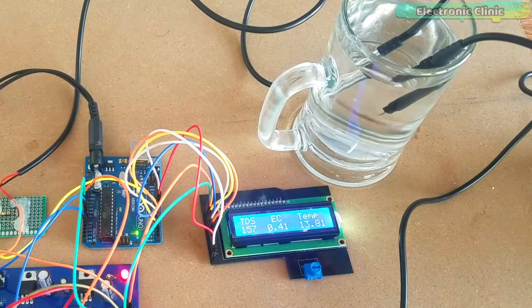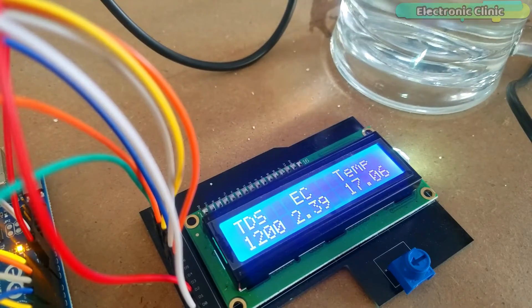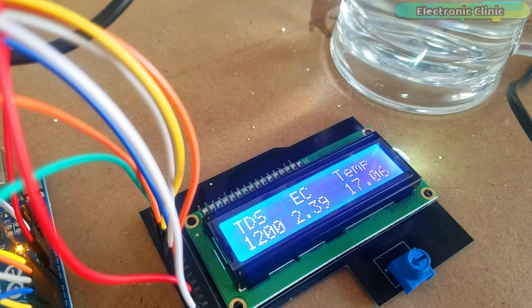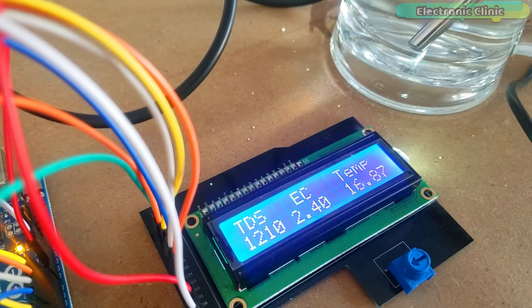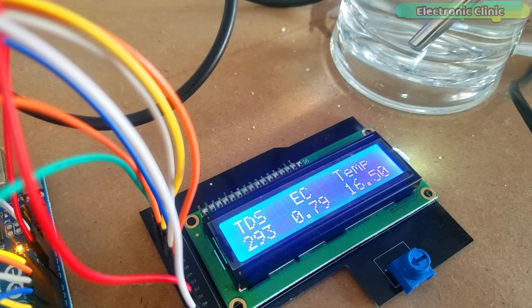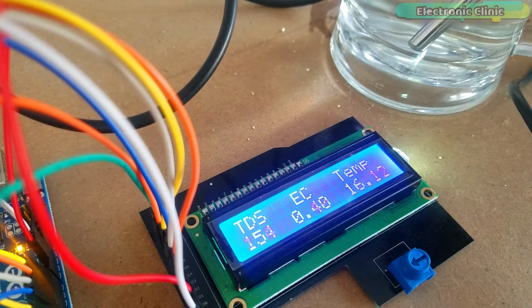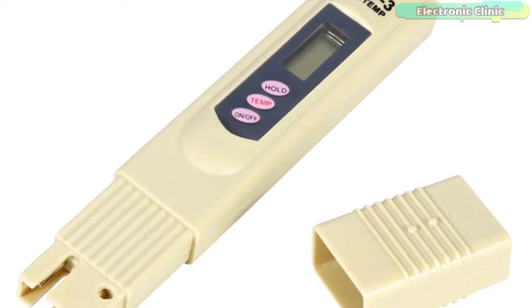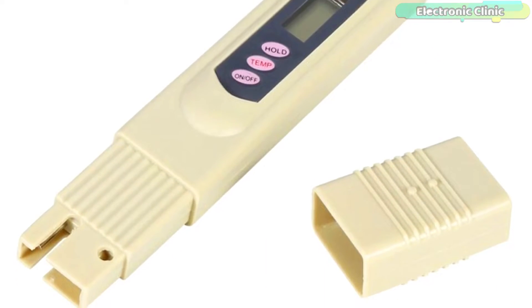The TDS value starts increasing as I start adding salt. Using this small DIY low-cost TDS meter, you can find out if the water you are drinking is clean or not. Along with the TDS value, you can also see the EC and temperature values, which I will explain in a minute. I will also explain what TDS value is good for drinking water.